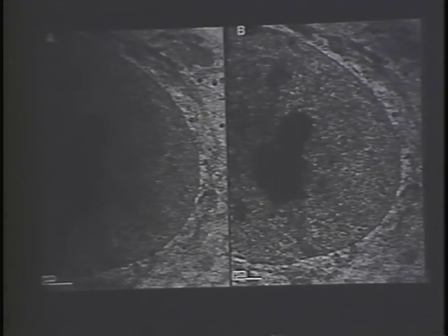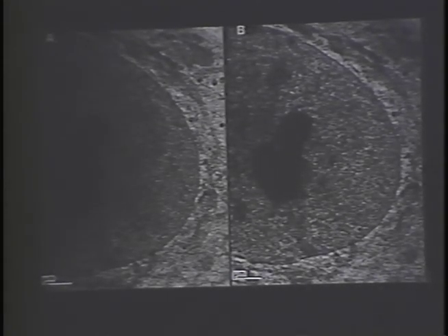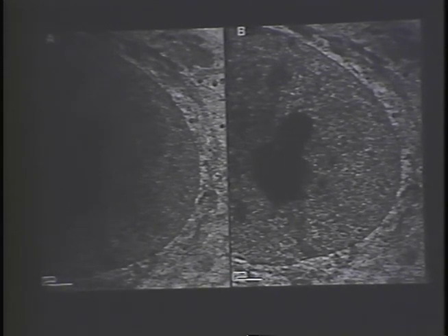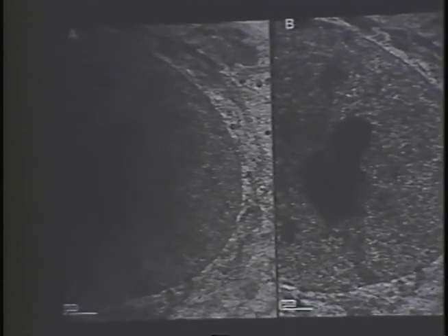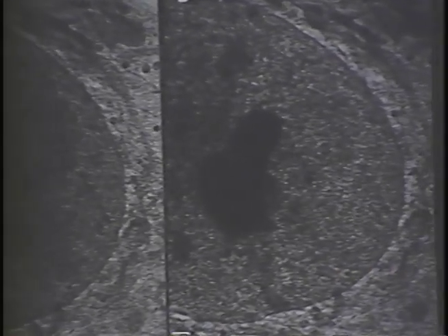Next slide. In contrast, PTK cells which have been dehydrated and critical point dried do not damage by bubbling when exposed to the same electron dose of over 100 electrons per square angstrom. Next slide.